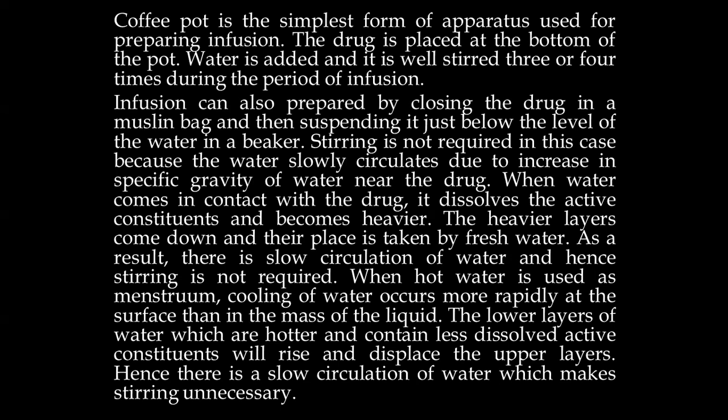This infusion can also be prepared by enclosing the drug in a muslin bag, and then this bag is suspended just below the level of water, not completely immersed into the bottom of the pot, just below the level of the solvent, and you can make an efficient extraction. In this methodology, stirring is not required. And why is stirring not required in this case? Because the water slowly circulates due to the increase in specific gravity, right?